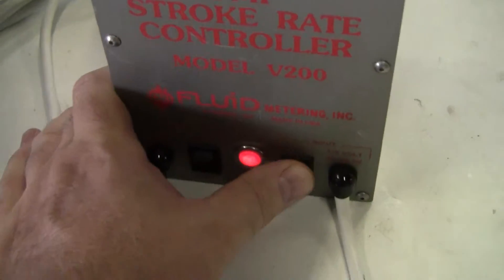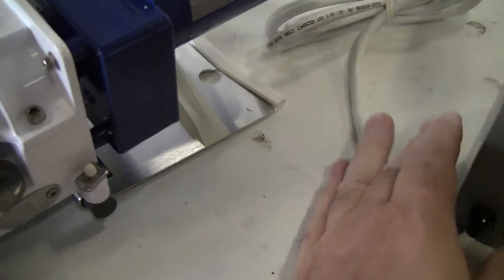Let's turn it on. The pump will go both directions.